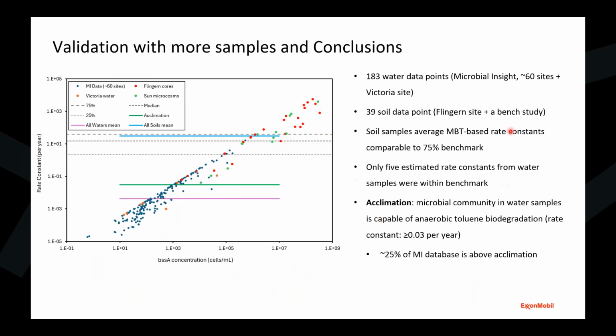Just as we wrap up today, I have one more question that was posed out there. It said, have you thought about using carbon-14 or carbon-13 labeled substrates to be able to look at rates of degradation? So I'll give you the MI experience and then maybe pitch it to Giovanni to wrap that up. We do a lot of carbon-13 degradation of toluene, so we have a lot of data that we've done for this over the past 20 years, looking on biotrap samplers, adding carbon-13 toluene and looking at degradation in organisms that are doing it and calculating first-order degradation rates in the field.